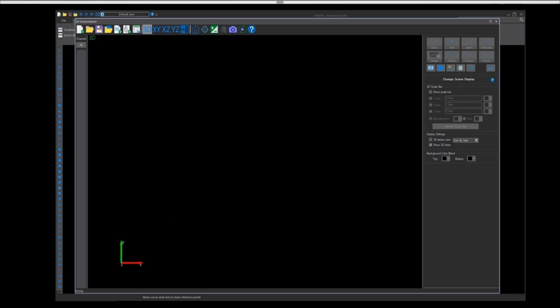So here you'll see I have the Neurolucida 360 program window open, and I'm going to use the data file that Aiden just showed in that last video to demonstrate how you can take existing data, or maybe data that's been converted from another segmentation source, into MBF XML and add these FAIR annotations. So using SciCrunch and the vocabulary terms to make each individual element more FAIR.